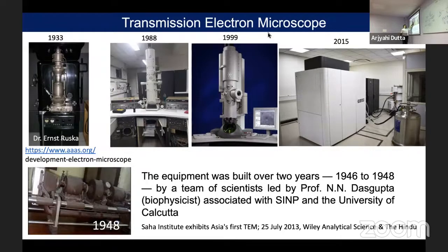Then we have a new system where we have the computer attached and we have a CCD camera, and it is much easier to visualize your sample immediately. And then now we have this sophisticated machine where you can screen multiple grids at the same time.